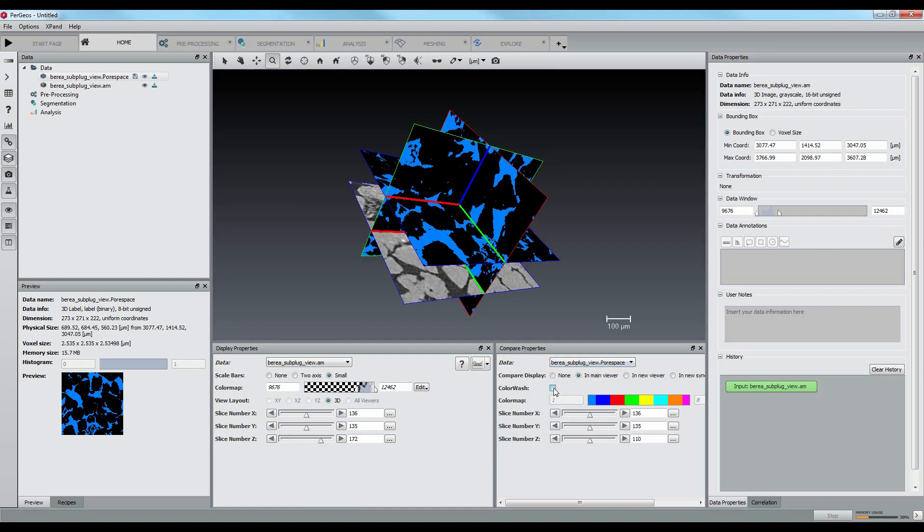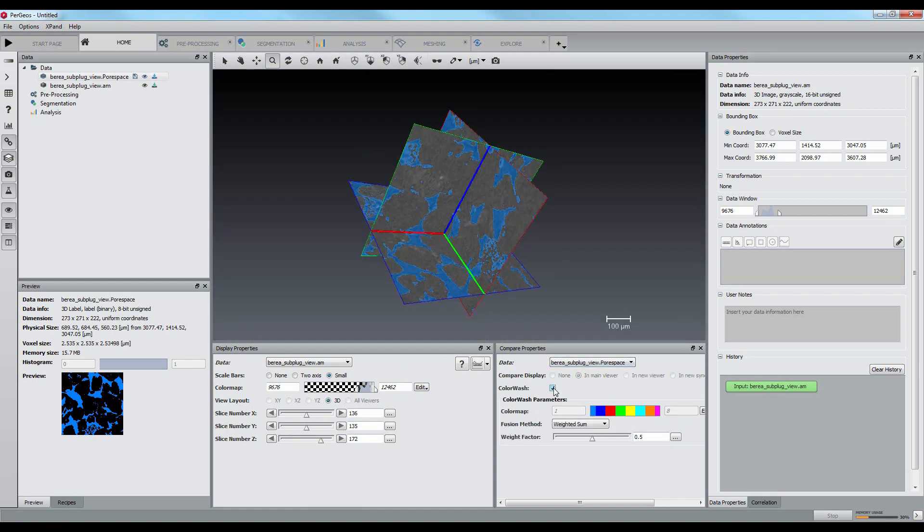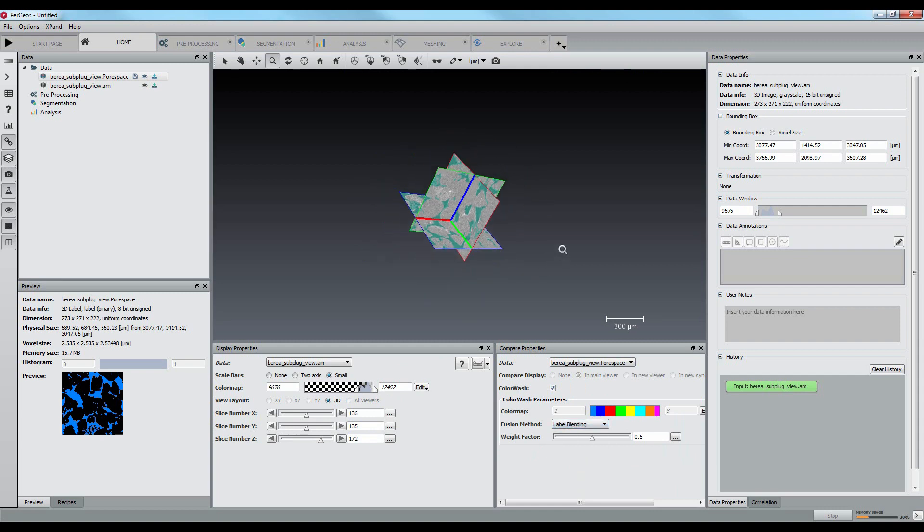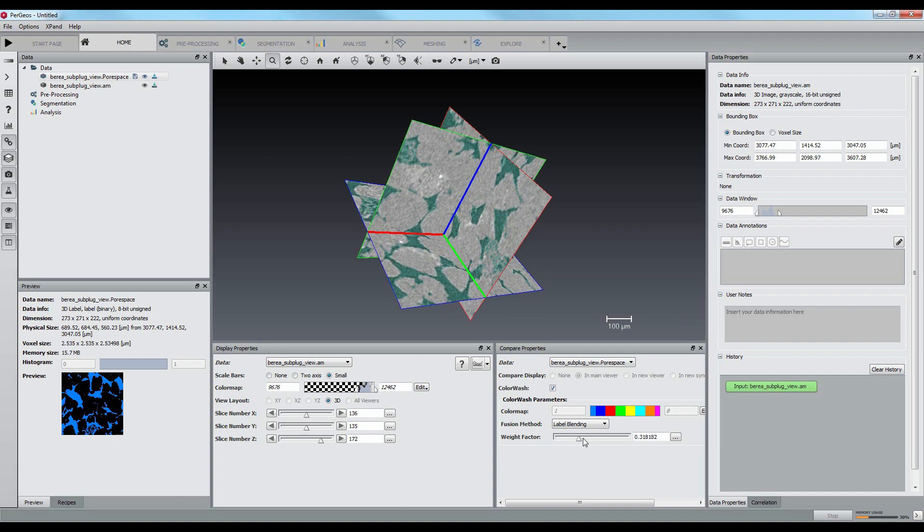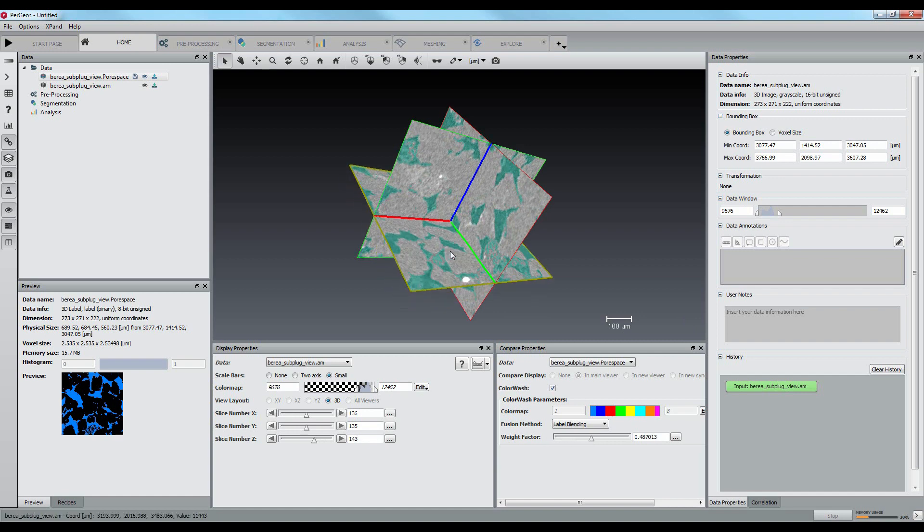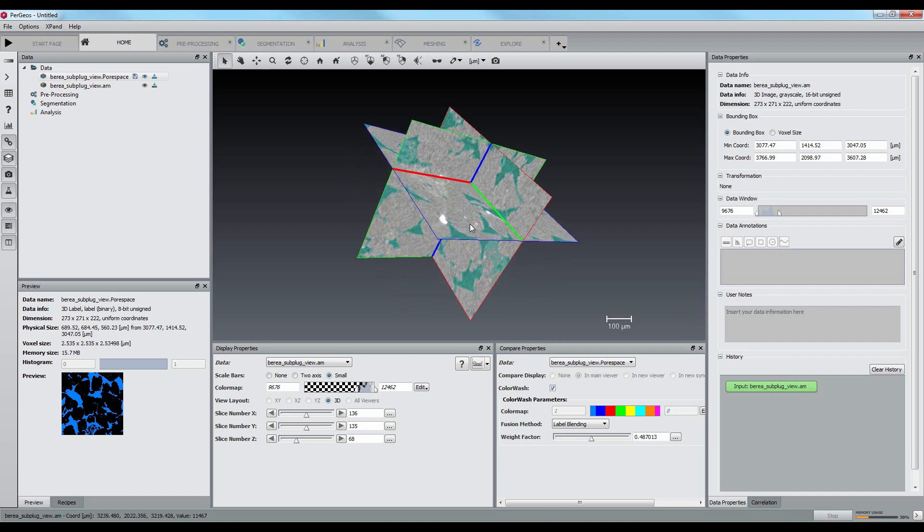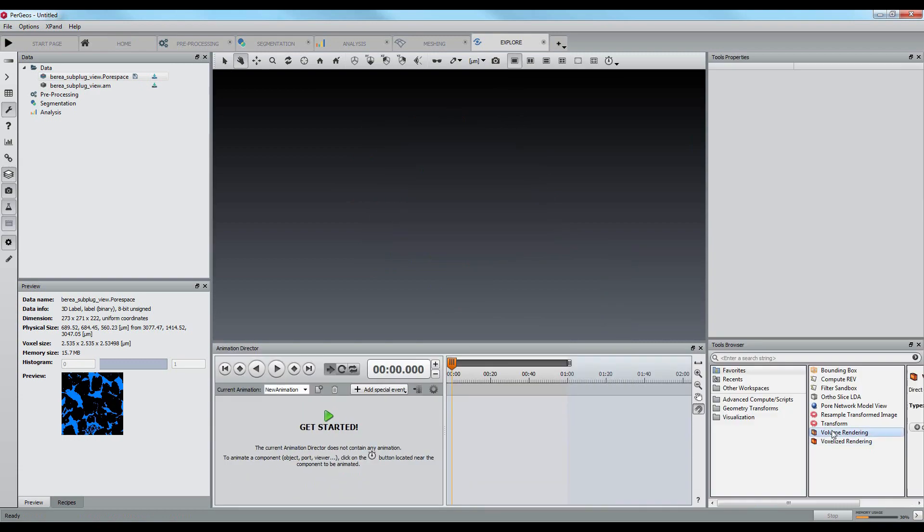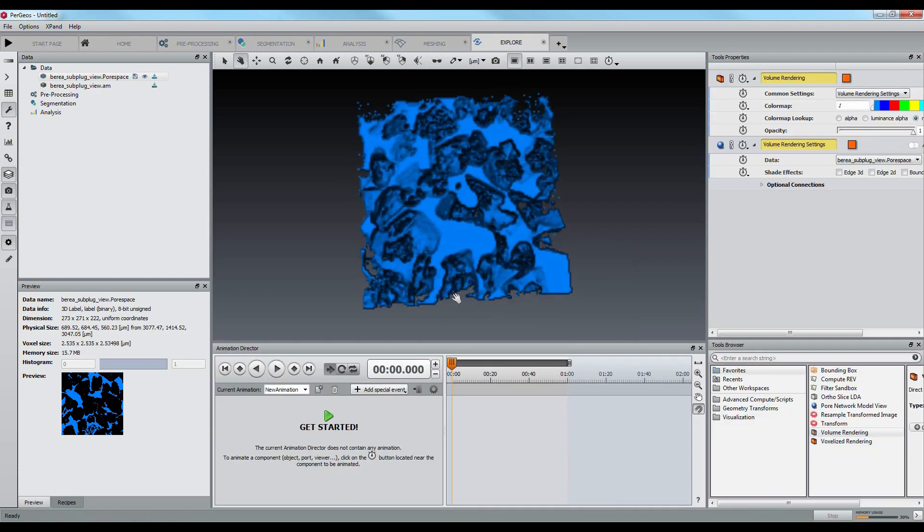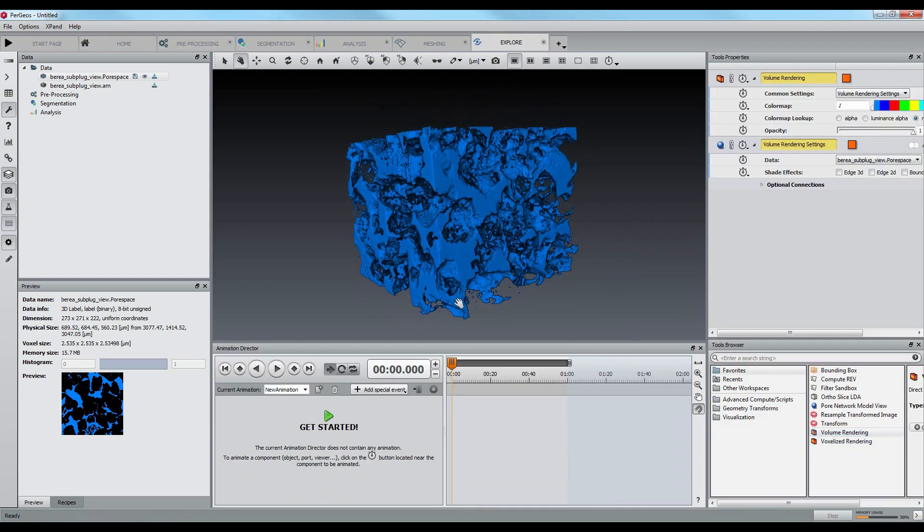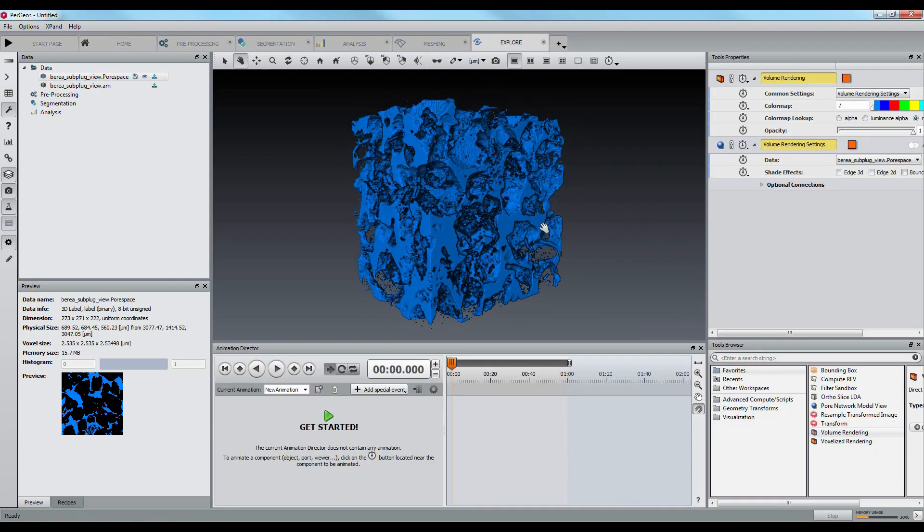Let's compare this pore space segmentation with the grayscale images. The volume rendering in the explore workspace will display the pore space in 3D.